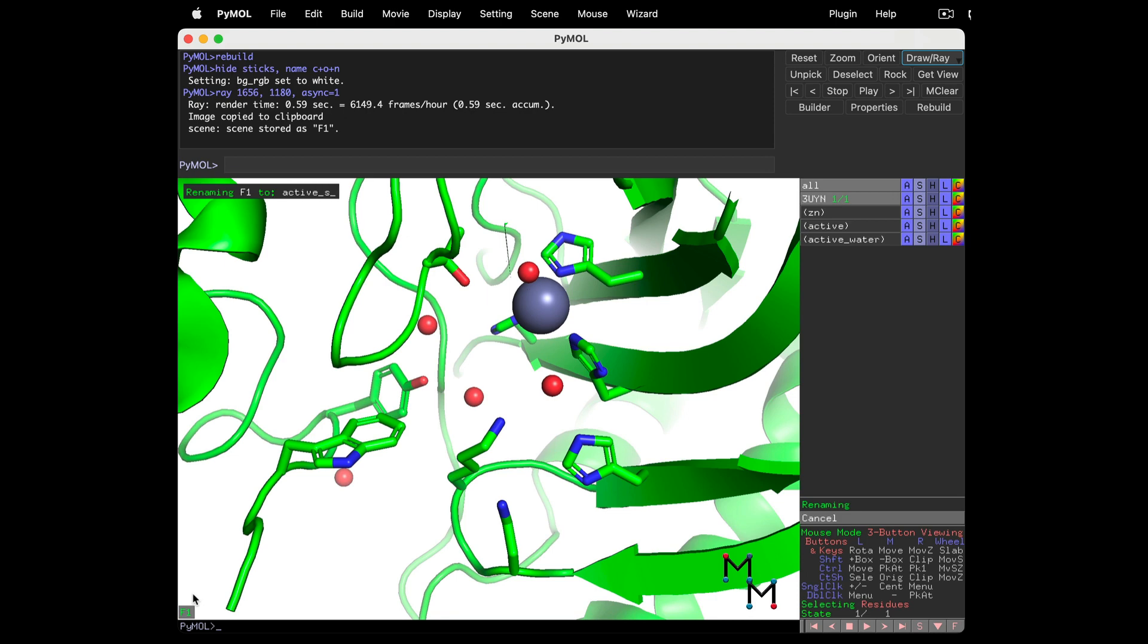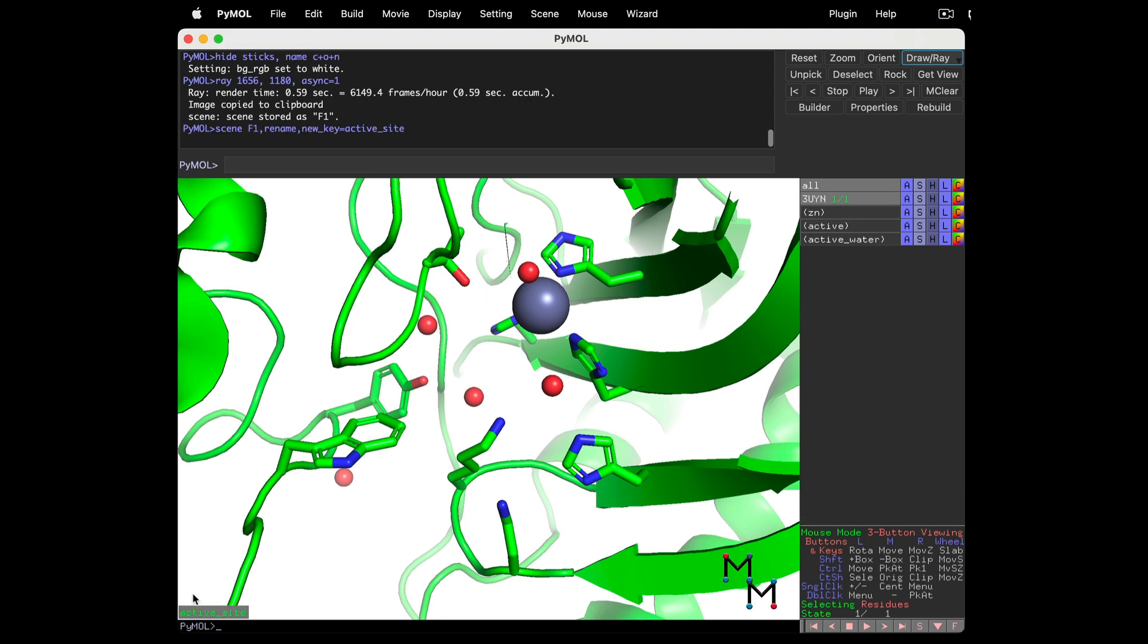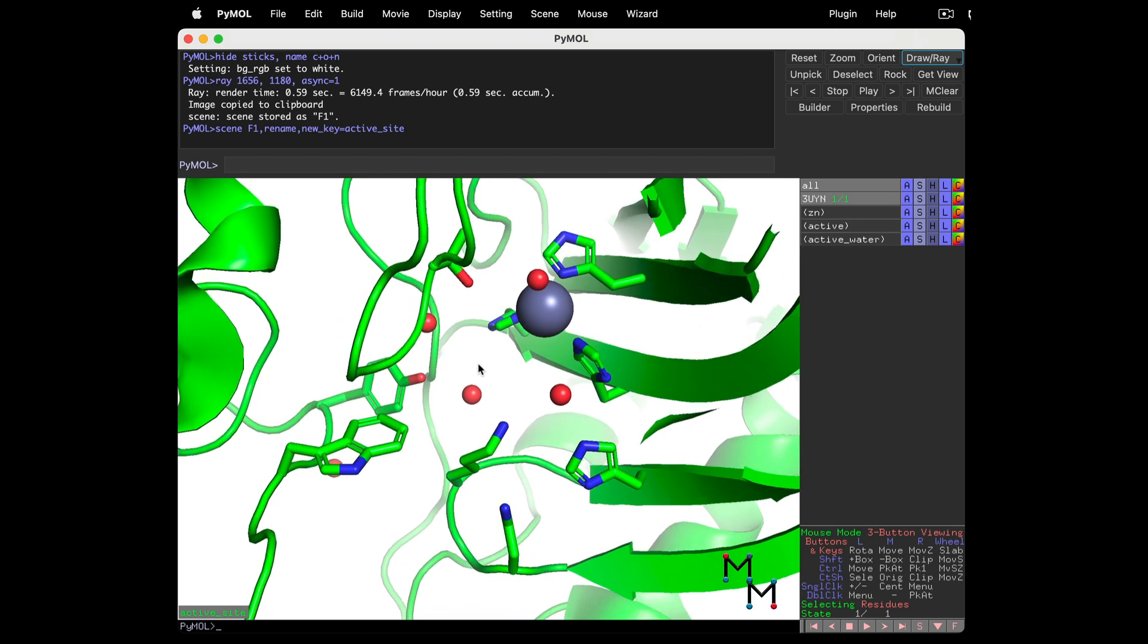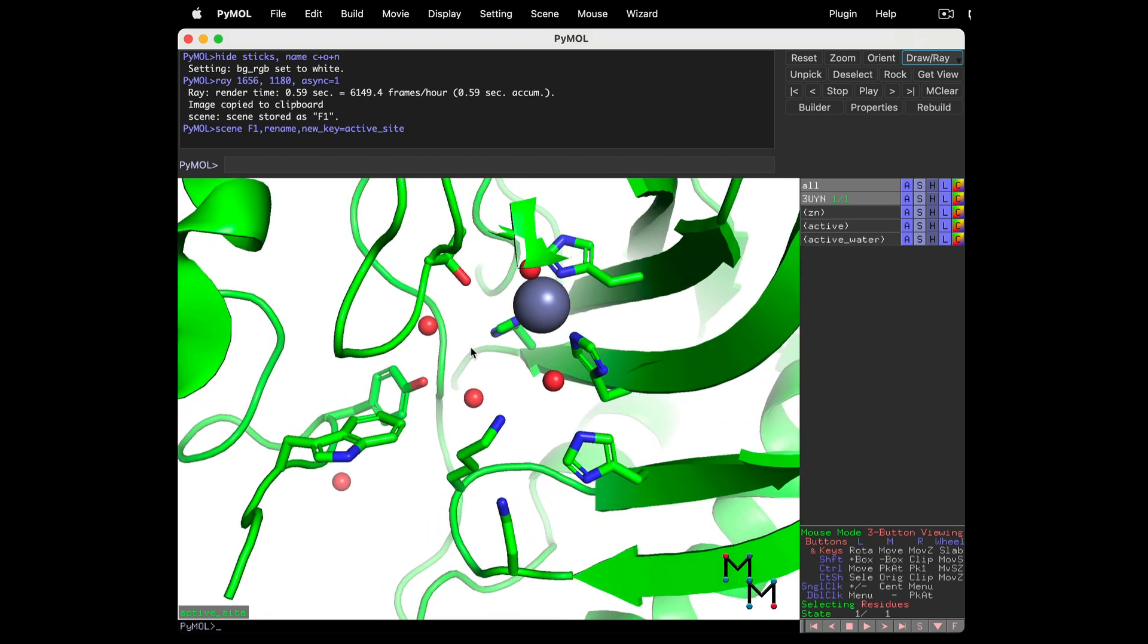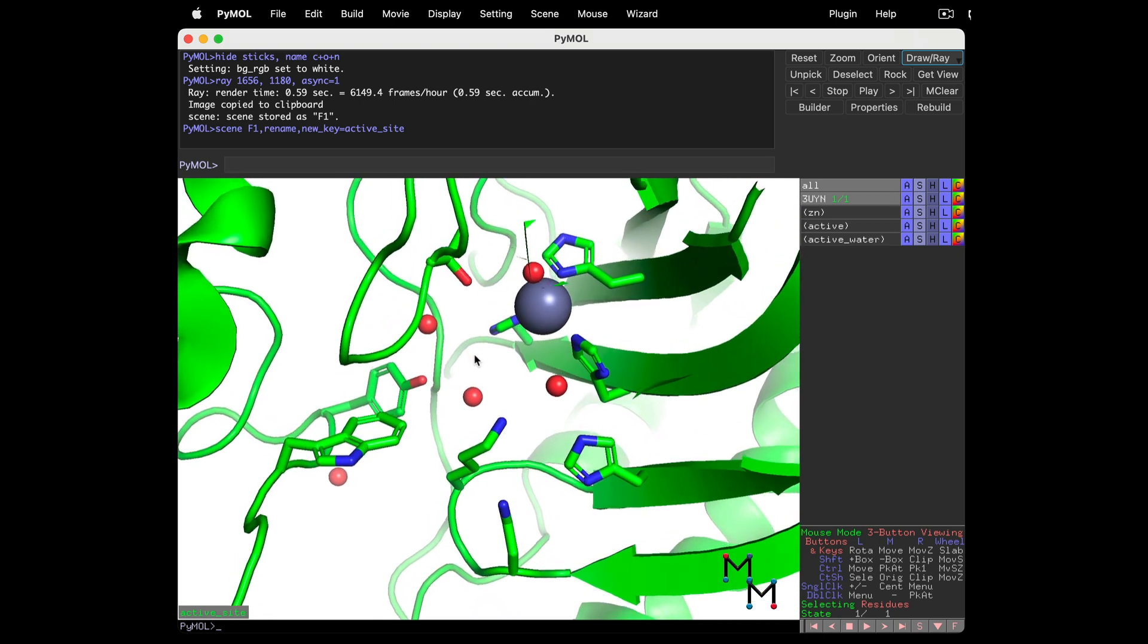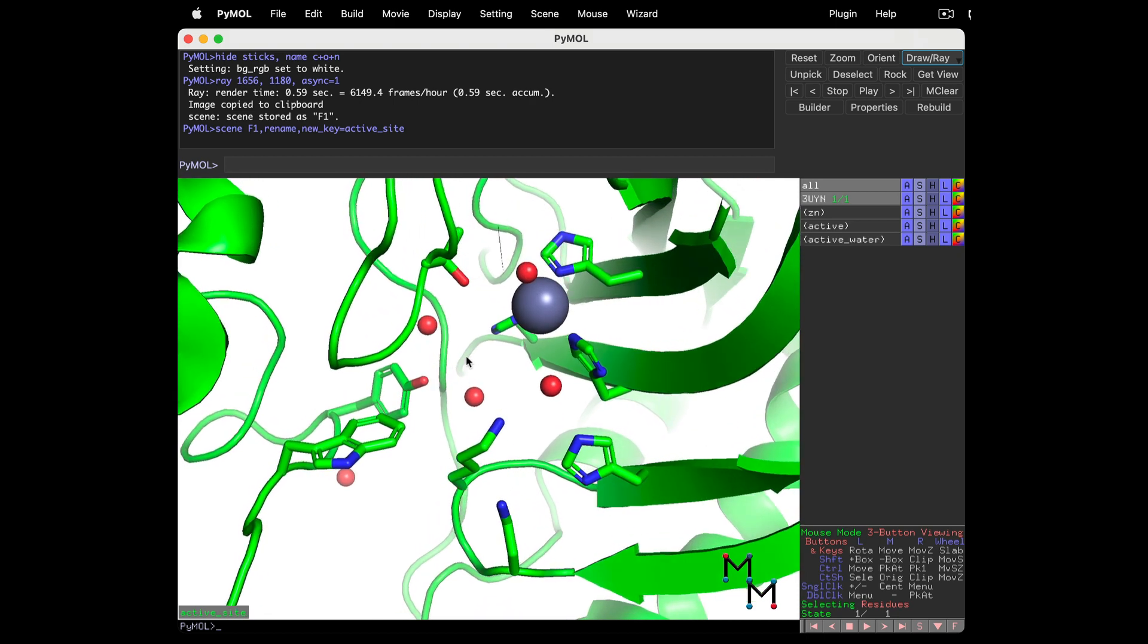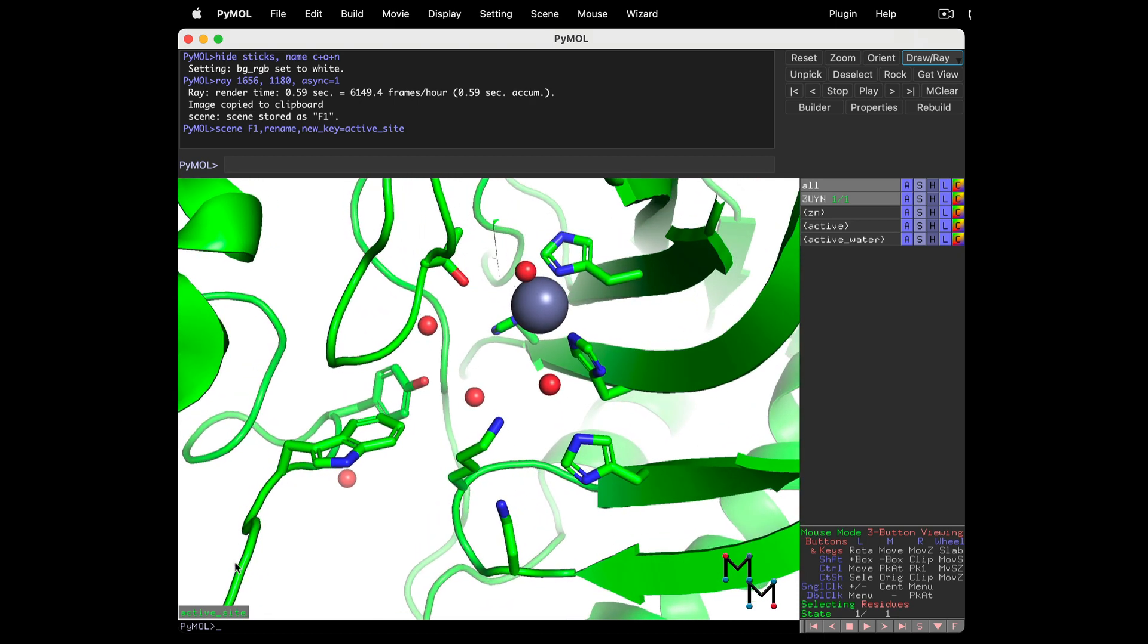Now if you make a small adjustment to the structure, and you want to update the Active Site scene, right-click and choose Update.